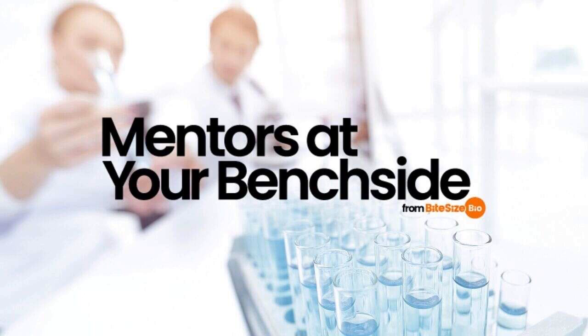Number 1, positive control. This is the one control for immunofluorescence you should always use in your experiments, as it's crucial to determine whether or not something went wrong during your staining. A positive control can be any tissue or cells where the protein of interest is known to be expressed in abundance. If you do not see staining in your positive control, you know something went wrong with the staining protocol.